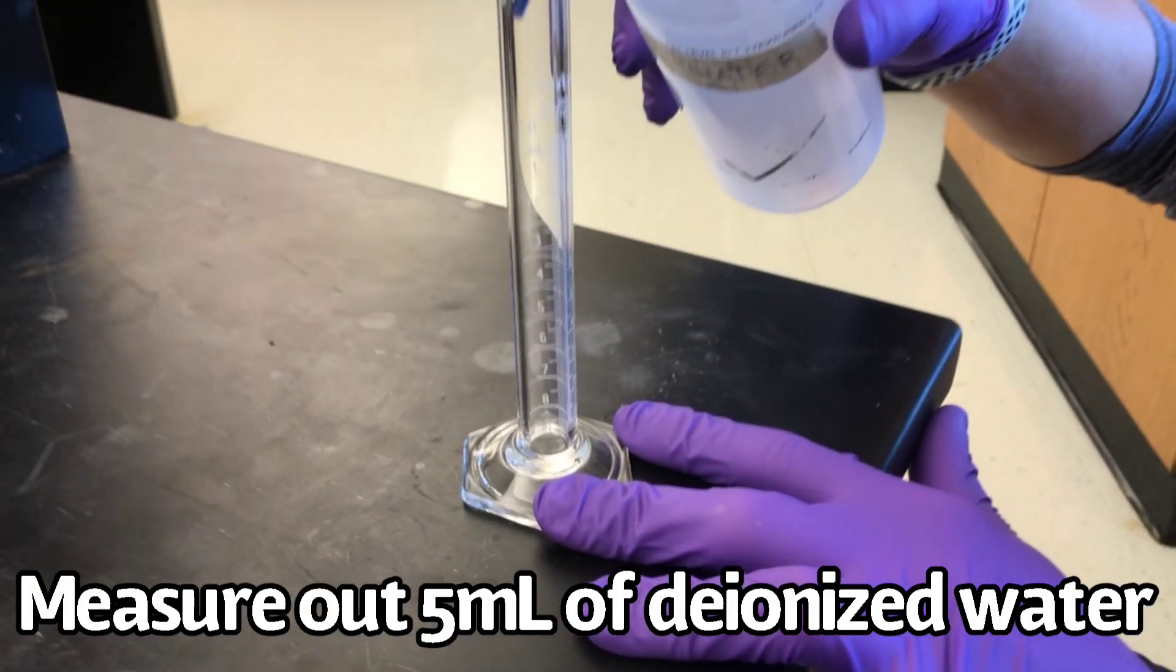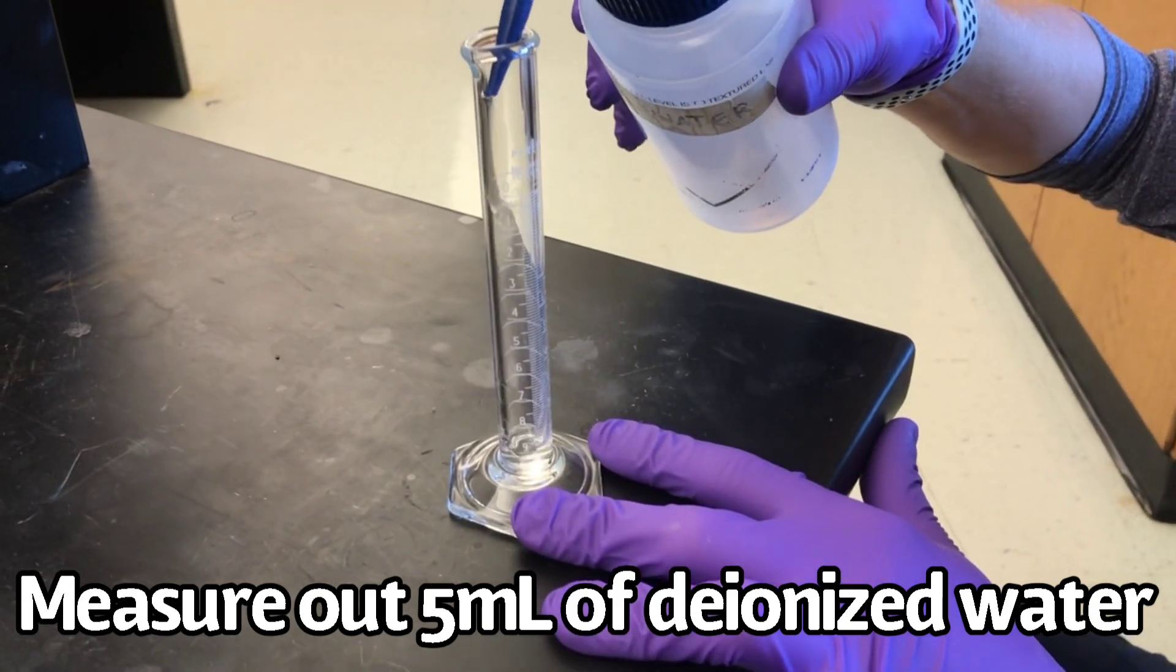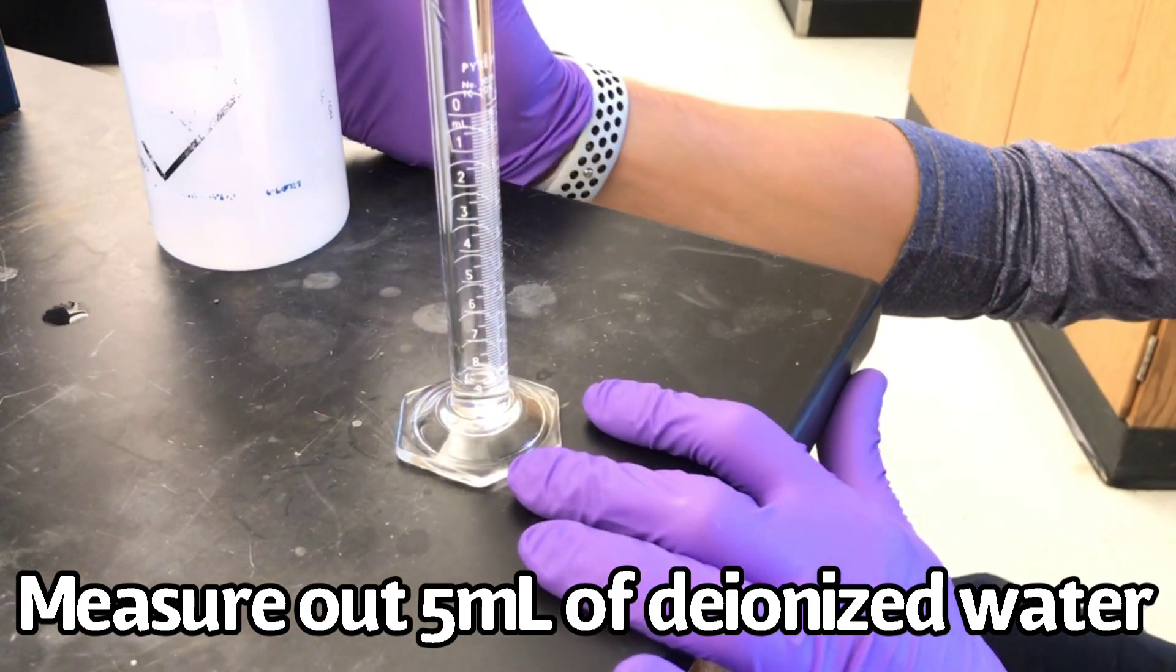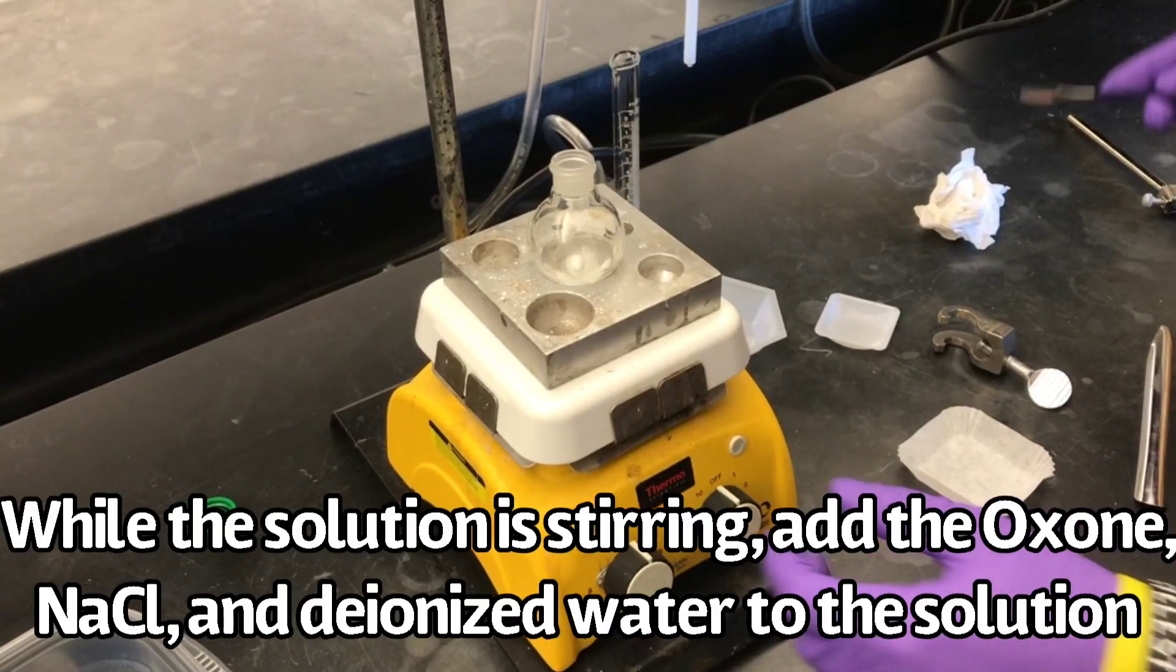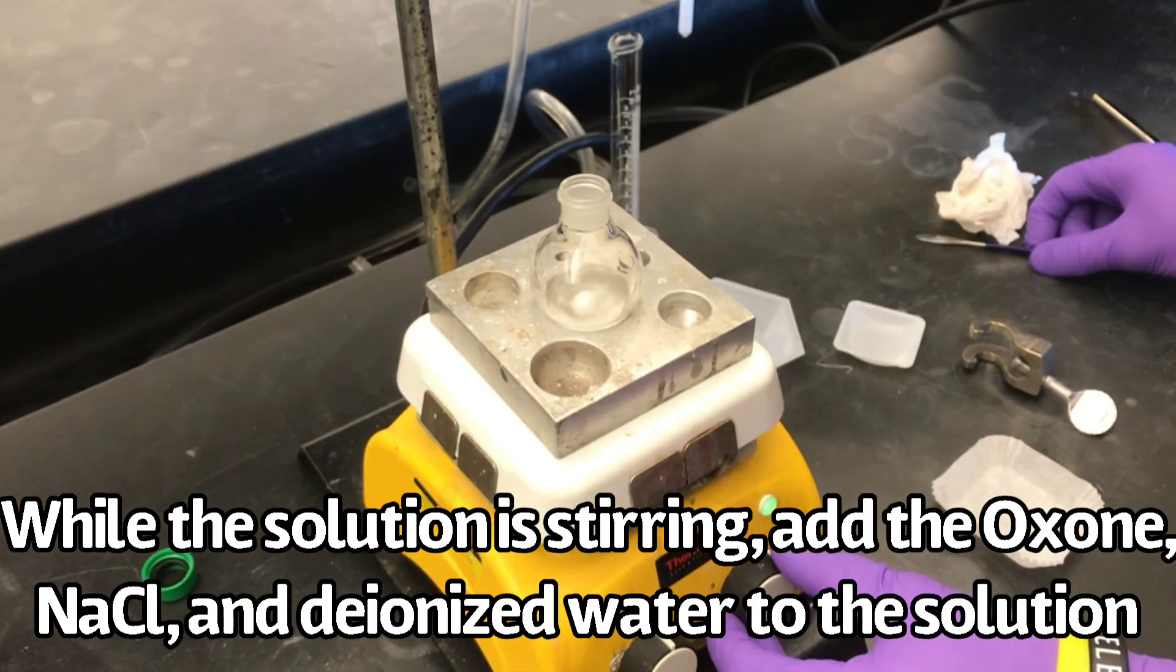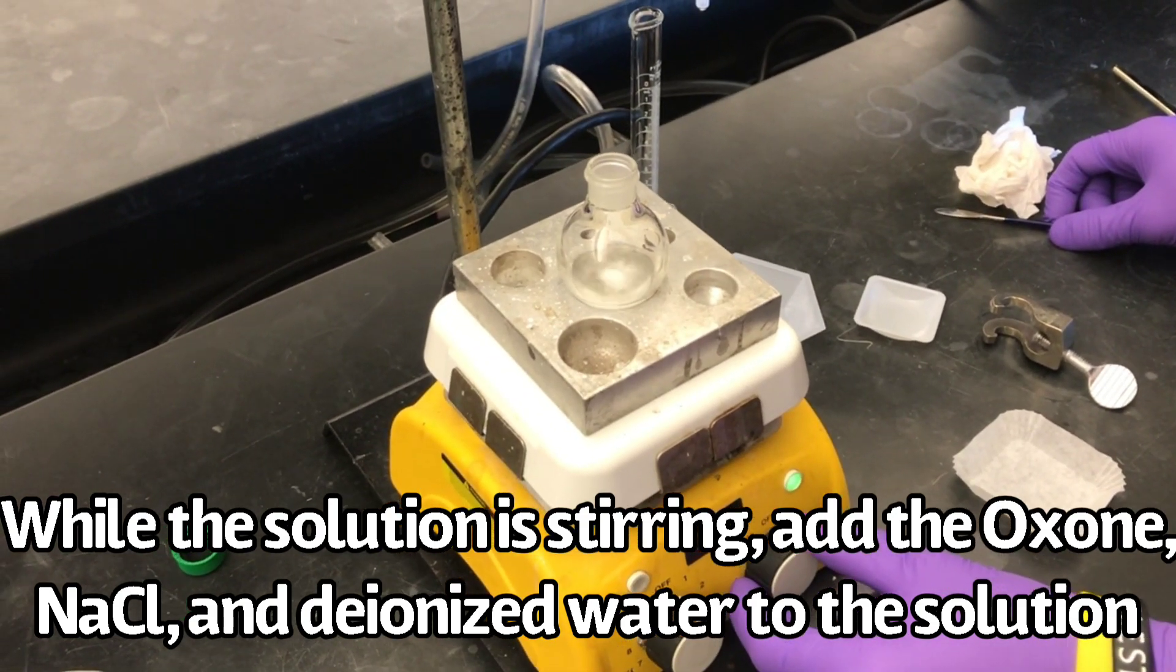Also, measure out 5 milliliters of deionized water. While the solution is stirring, add the oxone, sodium chloride, and deionized water to the solution.